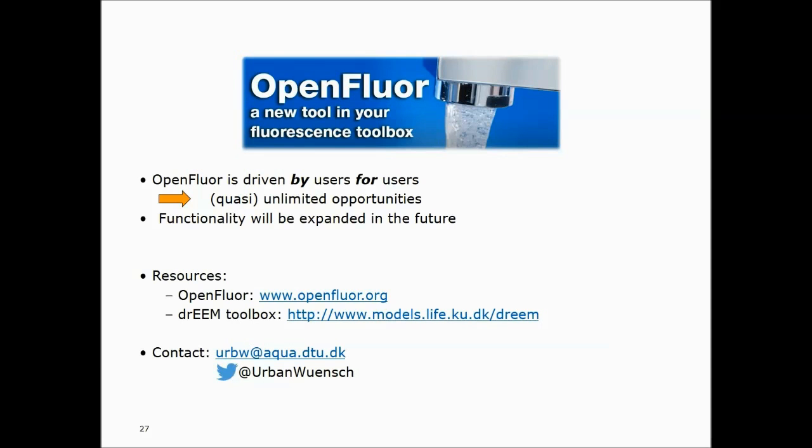Secondly, something that I didn't mention in the webinar: the text files that we uploaded to the OpenFluor database had to be in an OpenFluor compatible format, which was produced with the drEEM Toolbox. This is a MATLAB toolbox produced by Kate Murphy and Colin Stedmon, which you can download at the website listed here. And with that, I'd be happy to take any questions.